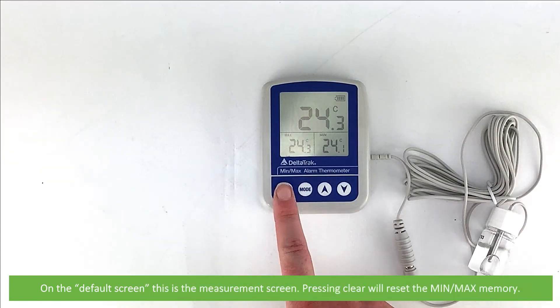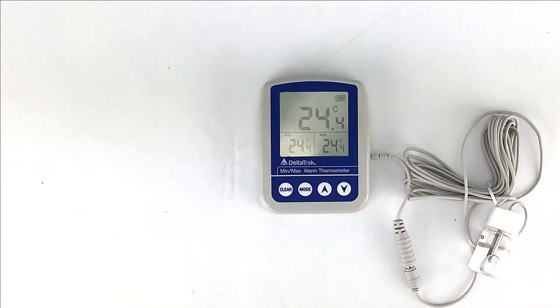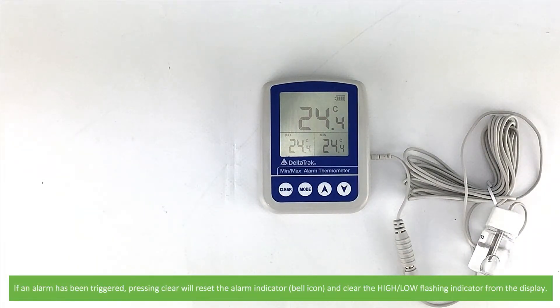On the default screen, pressing Clear will reset the minimum maximum memory. If a temperature alarm has been triggered, pressing Clear will also reset the alarm indicator and clear the high/low flashing indicator from the display.